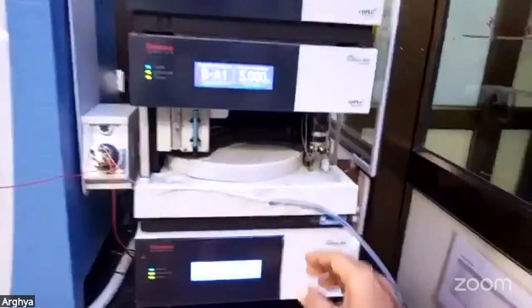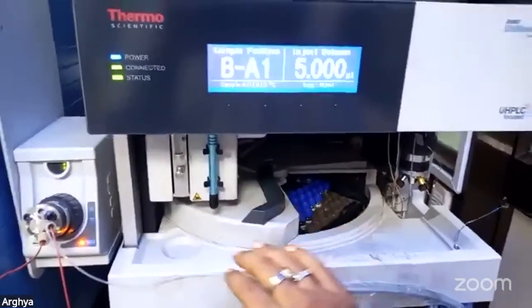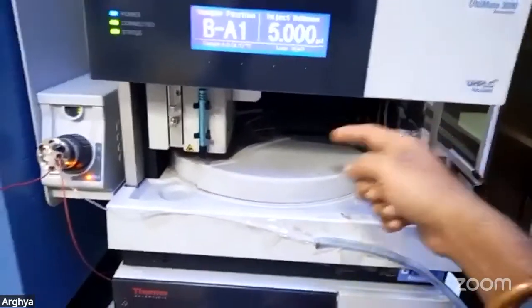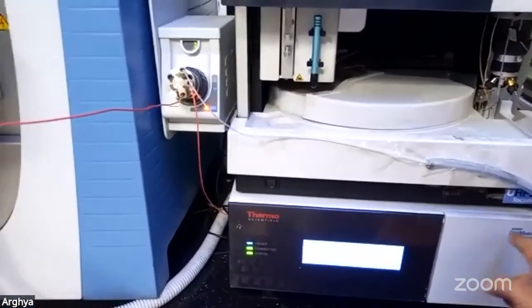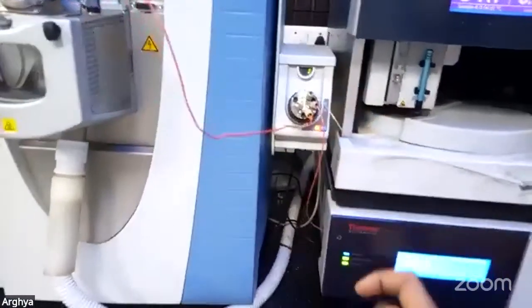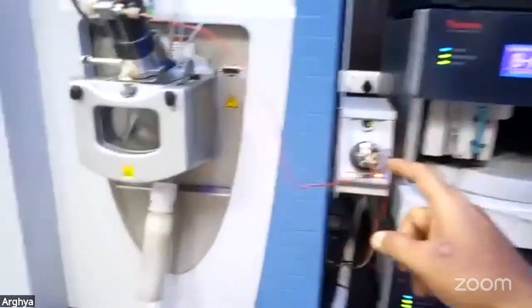You place your samples inside the autosampler, the injection happens, it goes to the column compartment, and from there to the real-time mass spec. Then the sample acquisition happens from the mass spec.